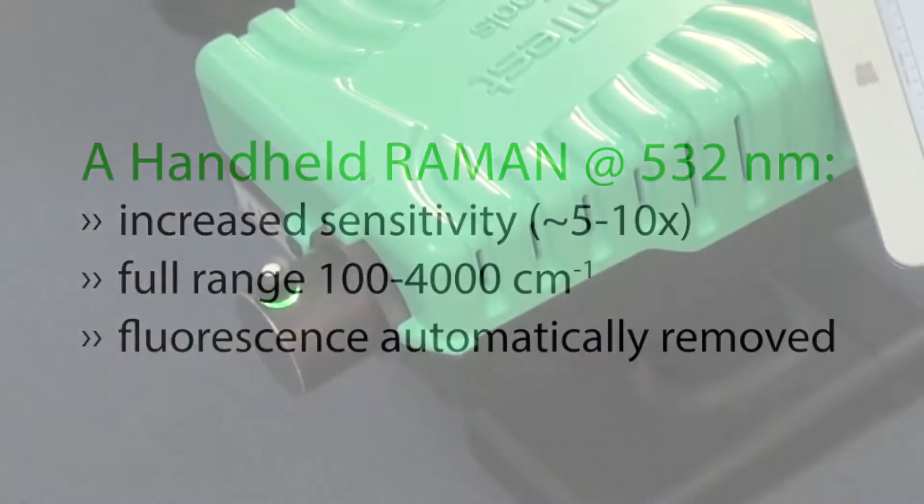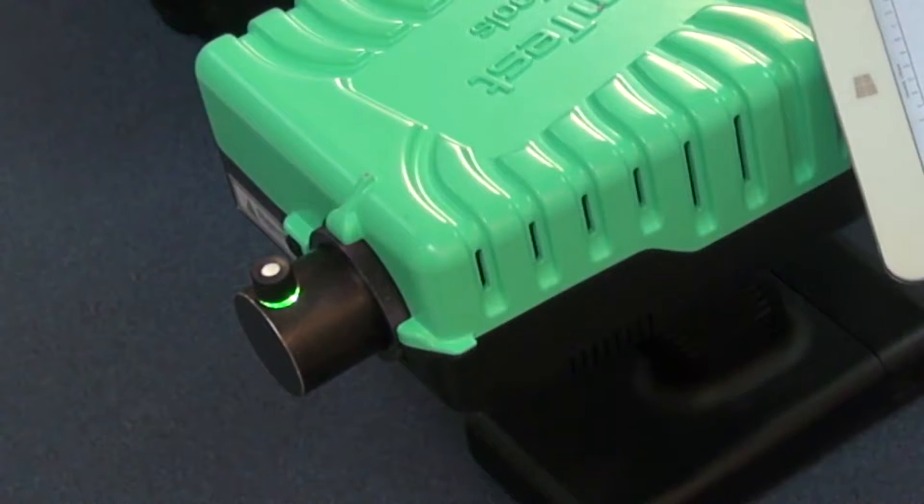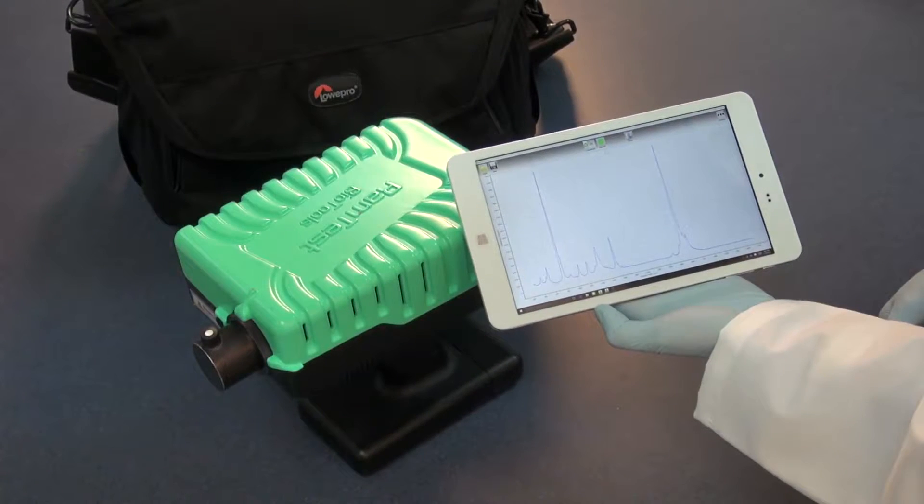Weighing under five pounds, it can measure in less than three seconds. That's five times faster analysis than other handheld units.